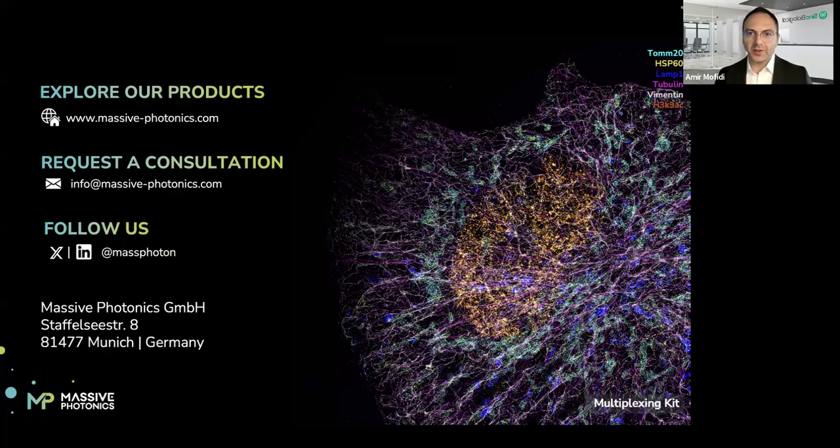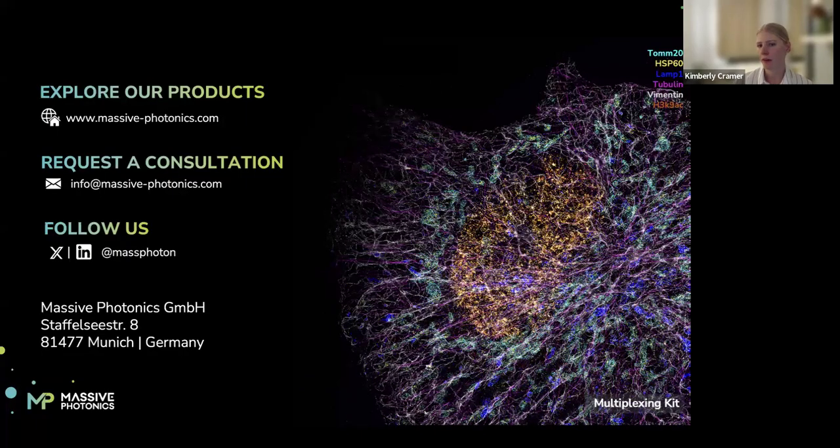So another question: how do you resolve the sub-nanometer scale? For sub-nanometer scale, you would need to use RESI. I didn't go over all the details today, but essentially, like I said, you would need to separate the target into different subsets of targets, and then look at these with sub-diffraction precision.